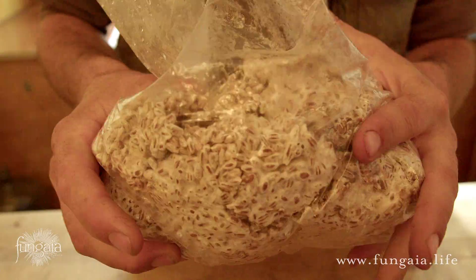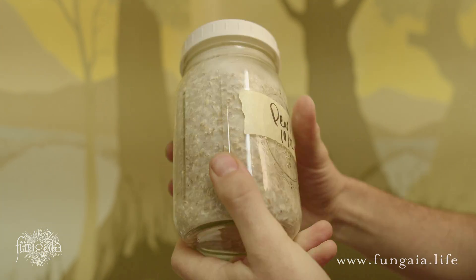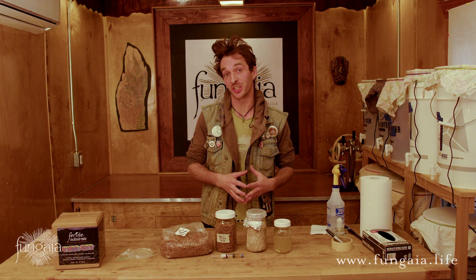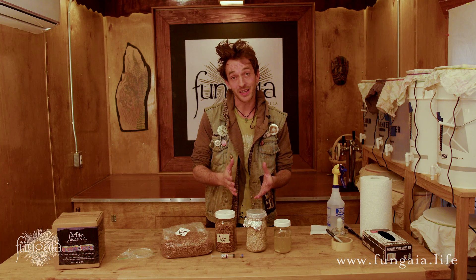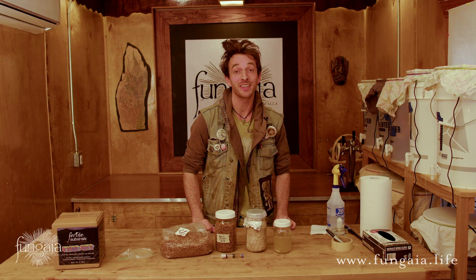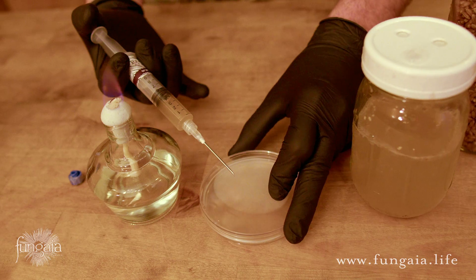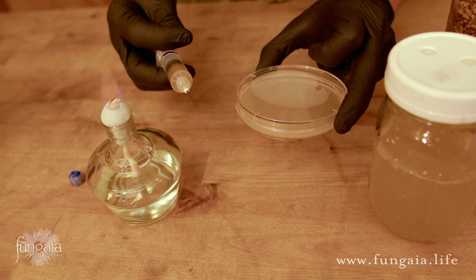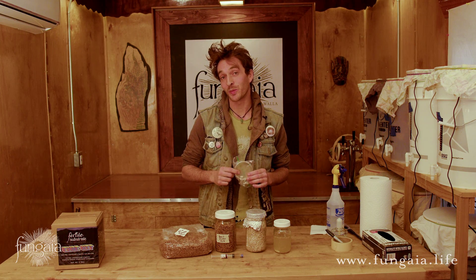After about three weeks, your grain will be fully enveloped in luxuriant white mycelium and is ready to use for the next step in the mushroom cultivation process. As you can see, this process is really quite quick and simple. Liquid culture syringes make it easy to get started in mushroom cultivation, allowing you to skip over the most delicate parts of the process so that you can focus on just growing the mushrooms. Then as you develop your techniques and gain experience and confidence, you can work your way backwards to more advanced techniques. Whenever I get a new mushroom culture, I always dribble a couple of drops onto a sterile petri dish. This helps me verify that the culture is clean and healthy, and if there is a problem, it allows me to see if the problem was with my process or with the syringe when it arrived.